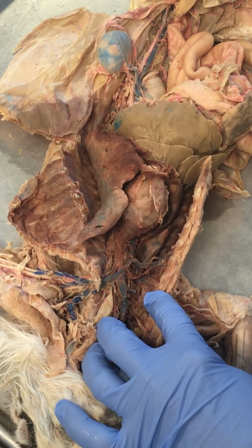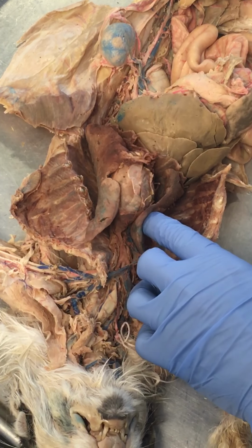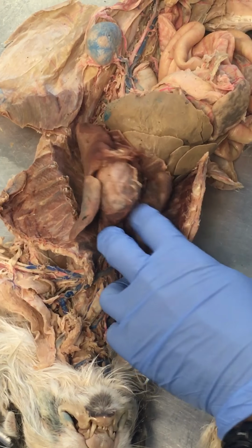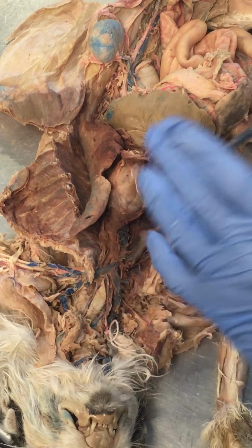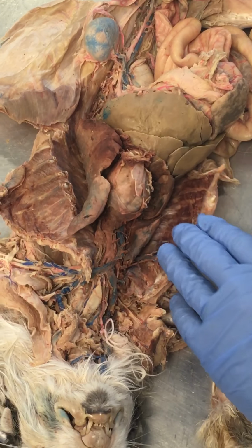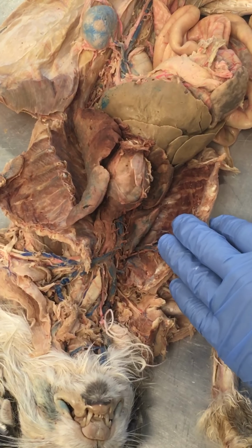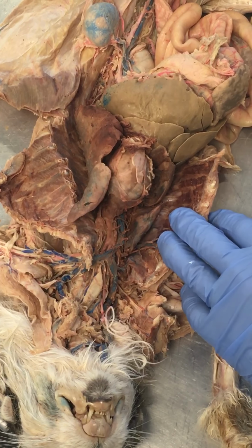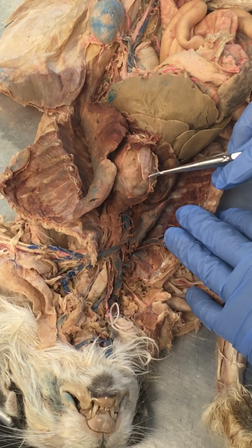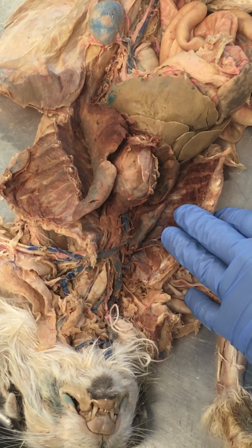All right. Now what do we have? Pulmonary veins. You can scratch those out. We said you could get rid of those. But they're in here. You guys did a pretty good job of dissecting those out. Remember, the arteries and veins are confusing when we talk about the ones up with the lungs, because the pulmonary artery is sending unoxygenated blood to the lungs from the heart. Arteries are always the same. Arteries always leave the heart. Veins always come back to the heart. But the pulmonary artery is sending unoxygenated blood to the lungs. The pulmonary vein is returning oxygenated blood back to that left atrium.